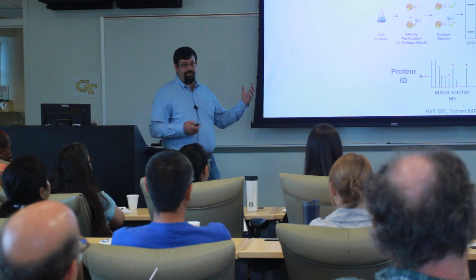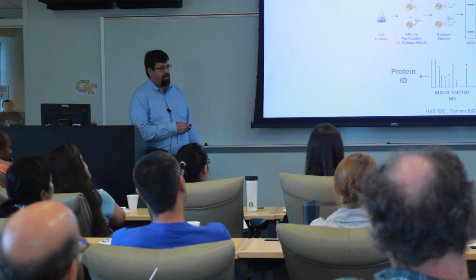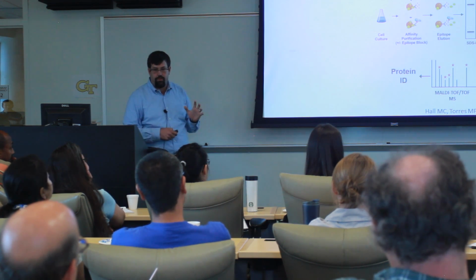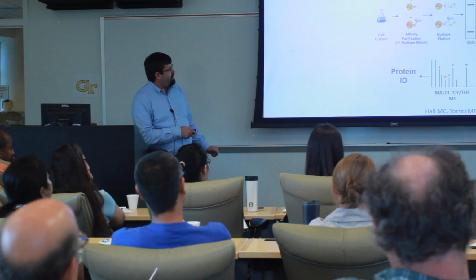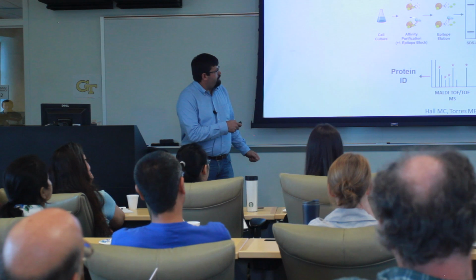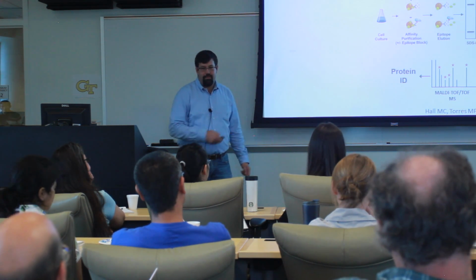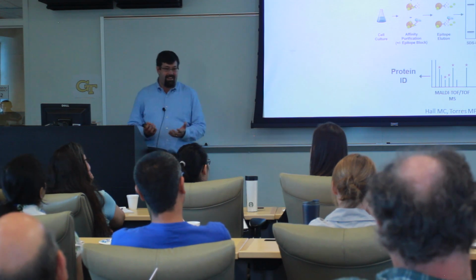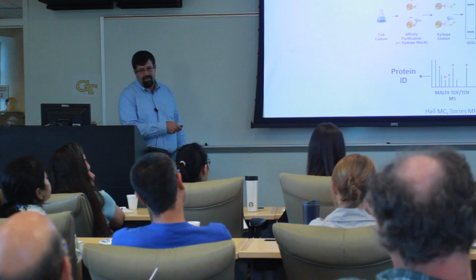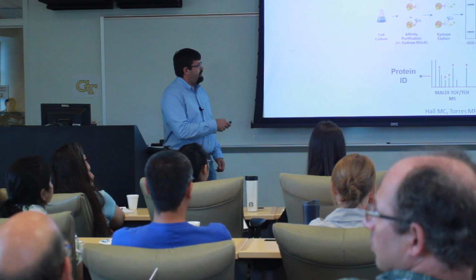We're interested in identifying all the components of that complex, right? So we pull down on one of those proteins. All the non-covalent interactions between the other subunits in that complex come along for the ride. So we affinity purify, and in this case, we did an experiment with a peptide epitope competitor or not, meaning we have a FLAG tag epitope that's not attached to anything in one of the samples, which should indicate any non-specific bands that should not be cut out for identification as associated with the complex.